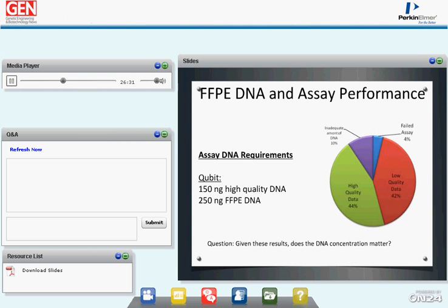So with our high-quality data, we saw an error rate of maybe 1 to 2% in terms of allele frequency. So by setting a threshold of 5% in our variant calling, we had no false positives arising from those samples. Whereas on the low-quality side, we saw variants somewhere in the 8 to 15% range. And if we'd repeat analysis, those variants would disappear and new ones would pop up. So we knew that those were false positives, somehow associated with something in the assay or with the DNA itself.